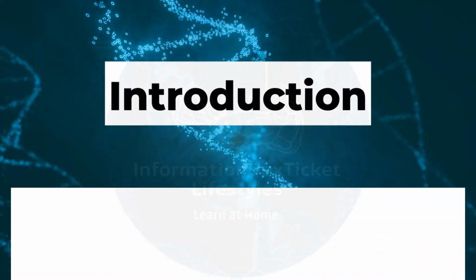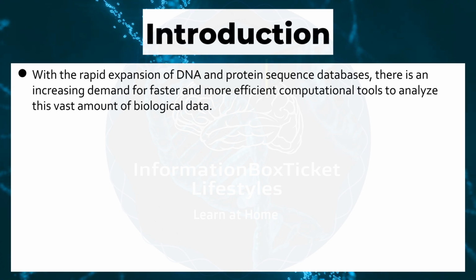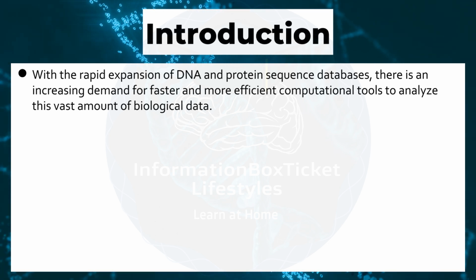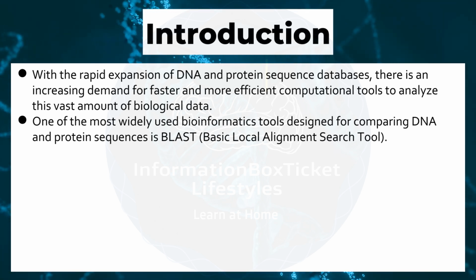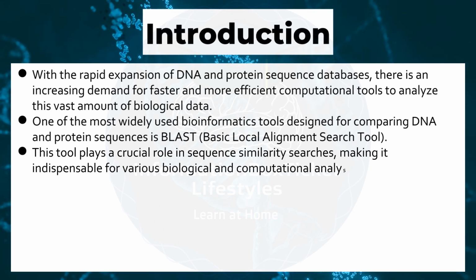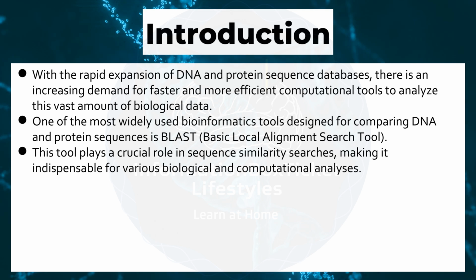Introduction. With the rapid expansion of DNA and protein sequence databases, there's an increasing demand for faster and more efficient computational tools to analyze this vast amount of biological data. One of the most widely used bioinformatics tools designed for comparing DNA and protein sequences is BLAST, Basic Local Alignment Search Tool. This tool plays a crucial role in sequence similarity searches, making it indispensable for various biological and computational analyses.